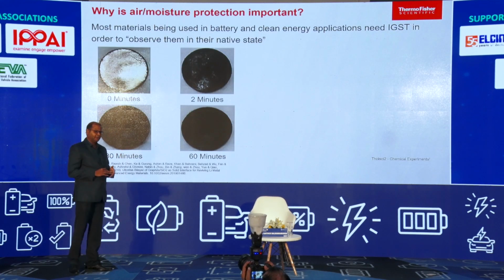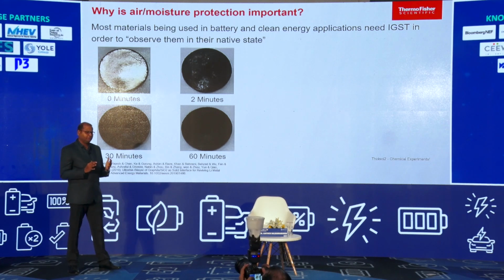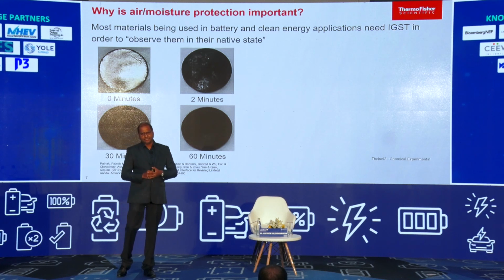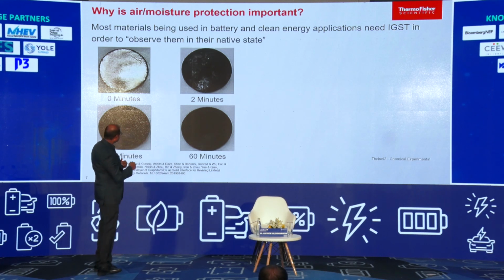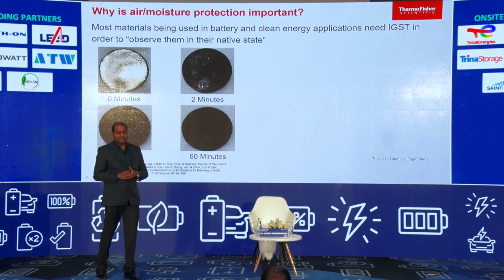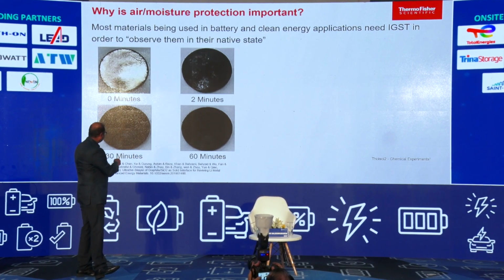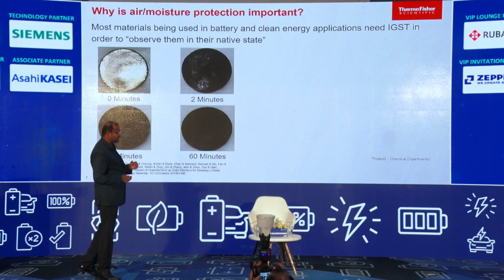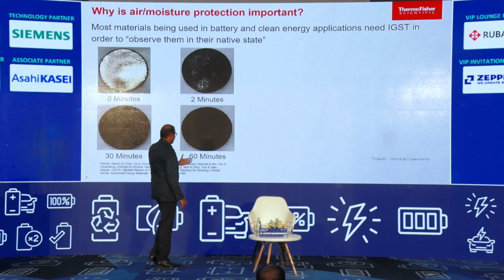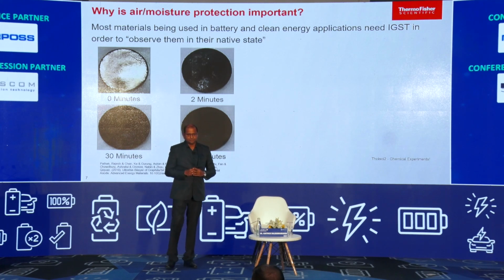But before we get into the workflow, one important criteria is why do we need to maintain the nativity of these lithium samples. Here is an image which shows the sample under different conditions. In a zero exposure moment, the nativity of the lithium is maintained, but as it gets exposed to the air, the oxidation spreads out and you will find the pure form of lithium is totally disturbed.